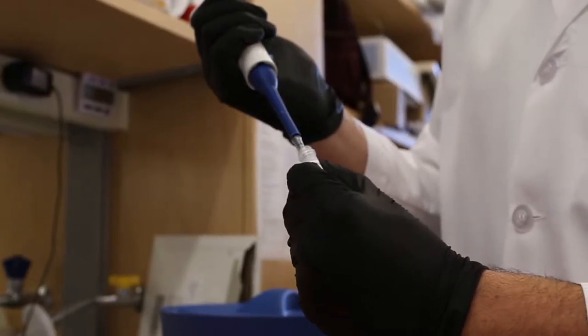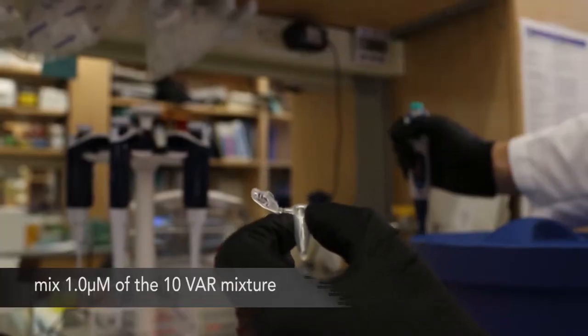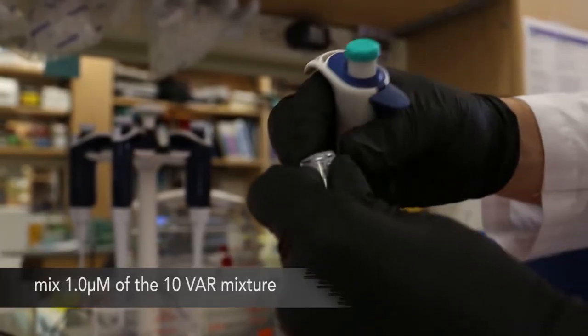Mix the following in a tube: 10.9 microliters of 100 micromolar 109 backbone mix, and 1.0 microliters of the 10 VAR mixture.